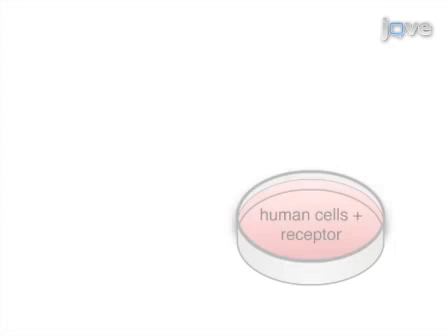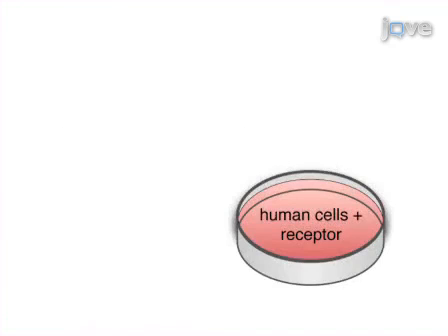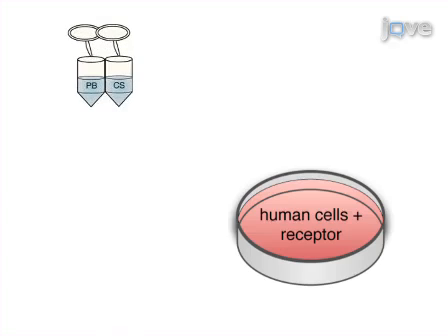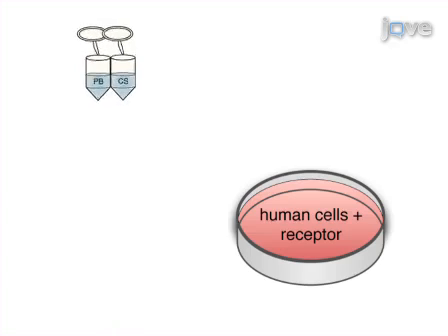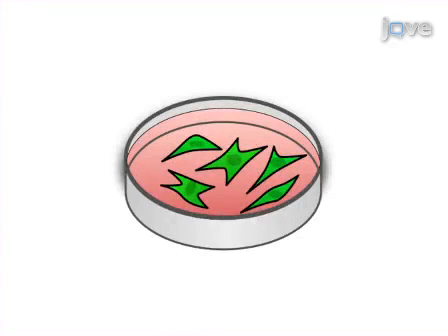Cells are transduced with the mouse retrovirus receptor, which makes them susceptible to transduction with ecotropic virus. Next, the cells are transduced with ecotropic virus in order to introduce the oncogene, using polymer-complexation with polybrene and chondroitin sulfate to enhance transduction. Results are obtained that show selective transduction of human cells with ecotropic lentivirus based on fluorescent microscopy and FACS.